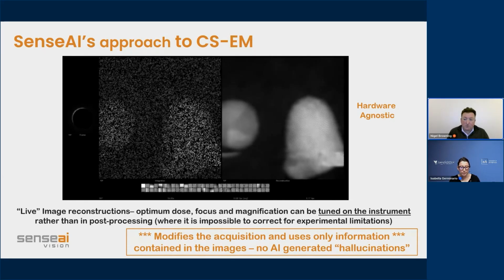So then you go to what we try and use, which is to say that, for 70 years, an SEM and a STEM has been optimized to go from the left-hand side to the right-hand side, fly back to the beginning, and then go again. And when it flies back to the beginning, it usually stabilizes at that location for a while. And that's why if you ever turn the magnification down with the STEM, you usually see a damaged track on the left-hand side. Now, some of the STEM manufacturers cut out that left-hand bit so you can't see it when you're running at high resolution, but you turn the magnification down, you see that out.